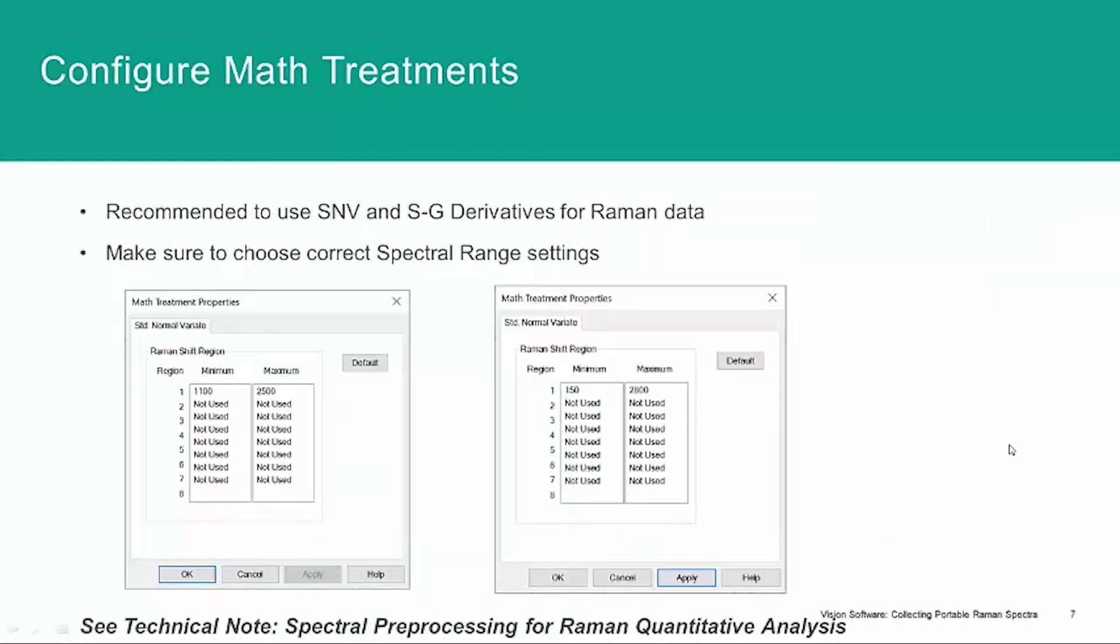I showed you configuring math treatments, and we do recommend SNV and Savitzky-Golay derivatives for Raman spectra. When you add your math treatments, make sure that you set the spectral range appropriate to the Raman data. And for the PTRAM, that is from 150 to 2,800 wavenumbers.